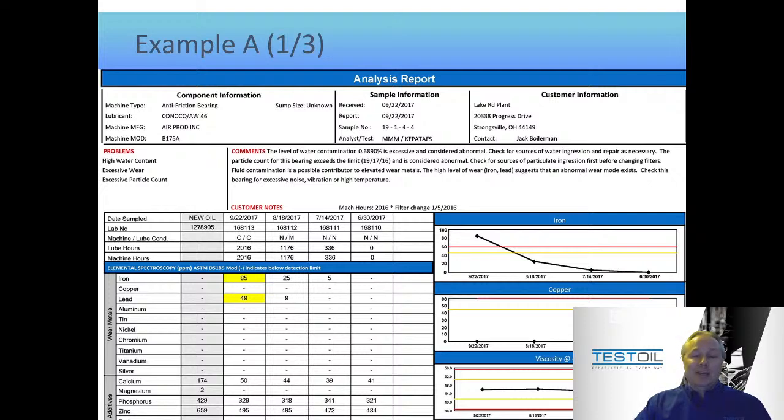And the easiest way to change something is make a change, right? Make a repair, make an improvement, do something. If you don't, it's going to continue to look the same. You're going to continue to see the same comments. But after you read the comments, you're now ready to move on to the next part of the report.